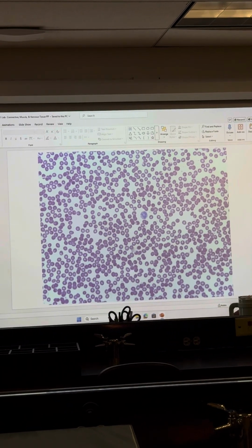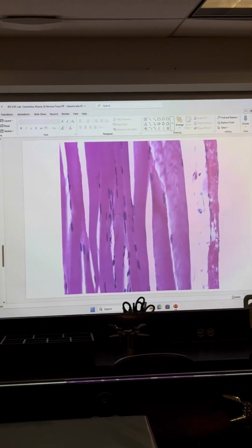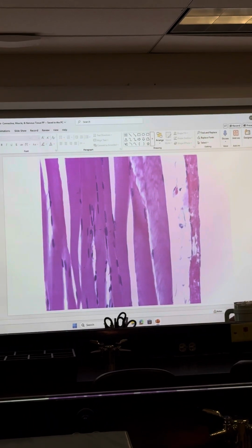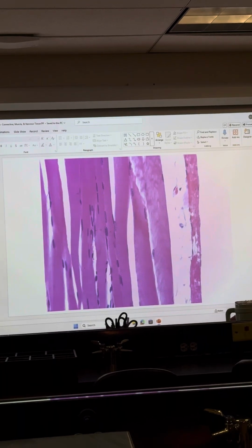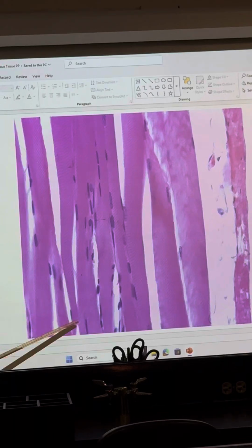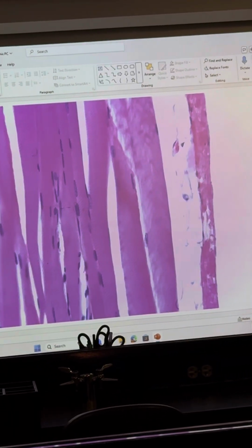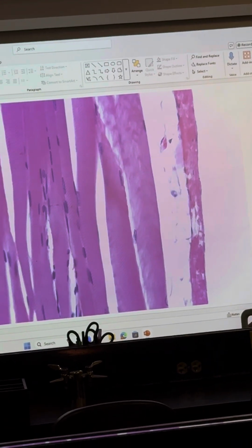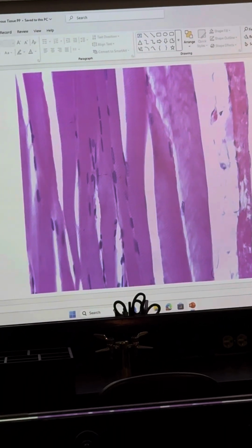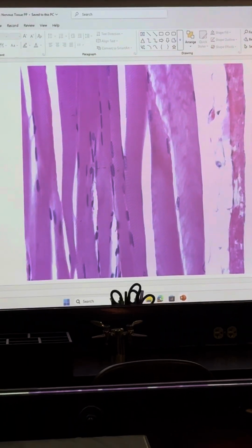Oh no, there's one thing I forgot. Okay, what is that one? I'll give you a hint. Those are not fibers. It's a different kind of tissue. It's got these striations, and it's long. So this is going to be skeletal muscle. Cool. Skeletal muscle, what does it do to the skeleton? It makes it move, right? Whenever you think of muscle, think move, contraction. It moves skeletal muscle. We find it in all the skeletal muscles.